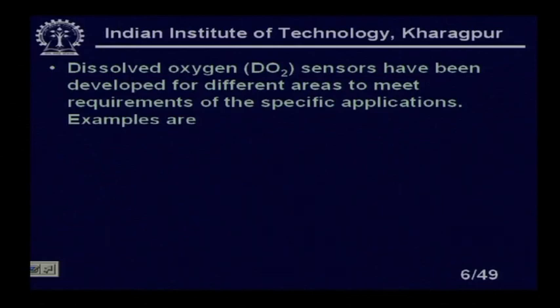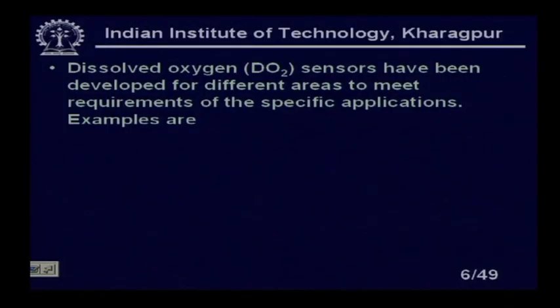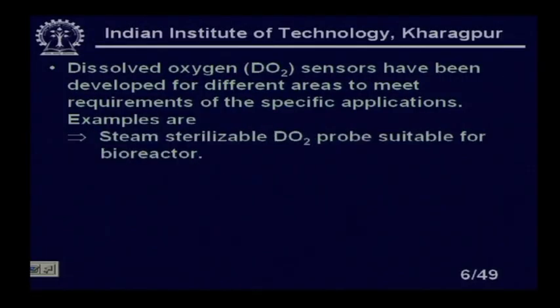Now, dissolved oxygen sensors have been developed for different areas to meet the requirements of specific applications. There are various applications, and accordingly people made different types of dissolved oxygen concentration measurement. The examples are the steam sterilizable DO2 probe suitable for bioreactors.